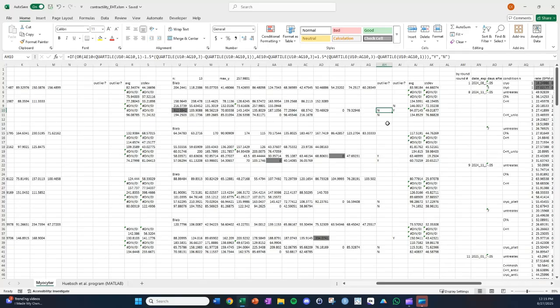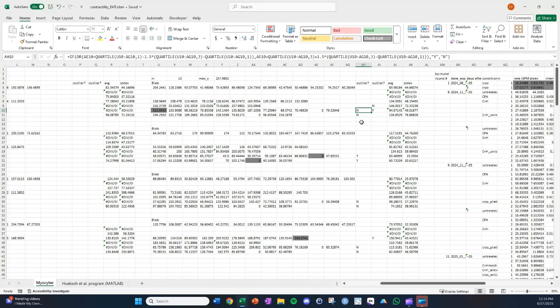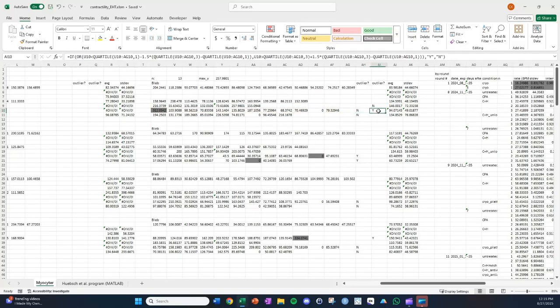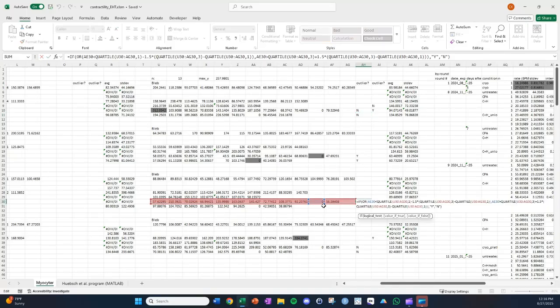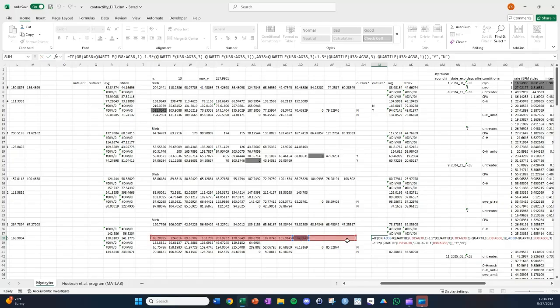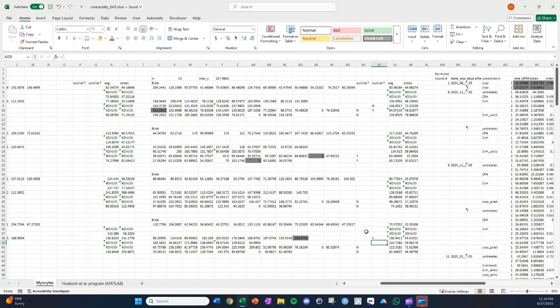So I don't think any of that data from 50% to 150% of initial would count as an outlier. Typically, what's registering as outliers is something like 300%. So that was this test here, something like 300% registered as an outlier for the beats per minute. Sometimes, even 0 is within expected for some of our treatments. So these zeros aren't actually registering as outliers because post-treatment we do see a drop in speed. But yeah, this 334% is registering as an outlier and so on. So I think getting enough replicates is important for distinguishing that.